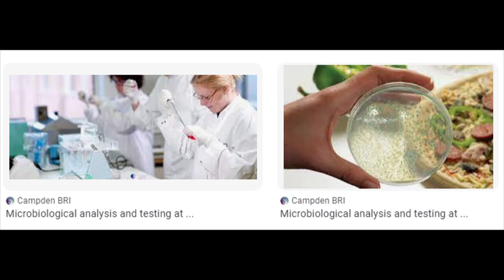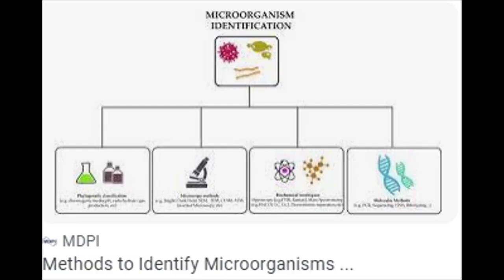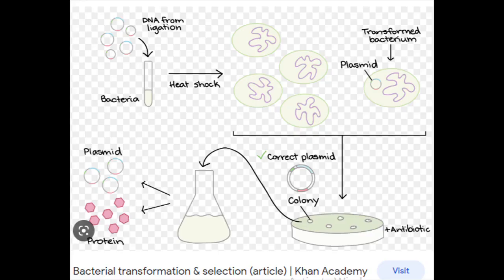In fact, the food itself, you can look at the food like this. You can smell the food. They bring the food, and you look at the physical appearance of the food. How does it look? Even from the way the food appears to your eyes, you can say, even though you have not tasted it, that this food looks somehow off. Those are direct examinations. Then you can also smell the food, and you can touch it. Normal fried rice, you know how it will be, but this fried rice, how is it like this? As you touch it and smell it, you know that something is wrong somewhere. So these are some ways to examine the food by direct examination.